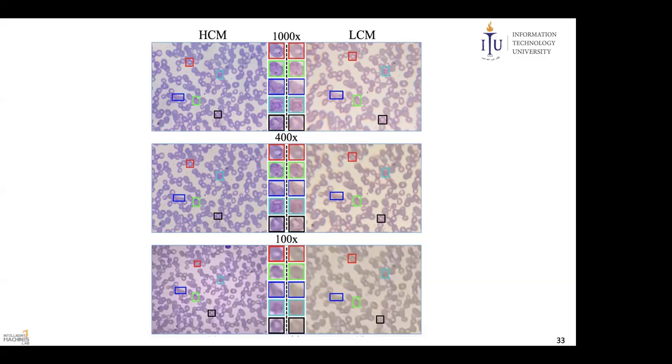One is the quality of the lens, which is very good. Second is the field of view, which is large. And third is the knobs. A high quality microscope has very precise knobs to move around and see things, but on a low quality microscope, you move the knob a little bit and it moves a lot.